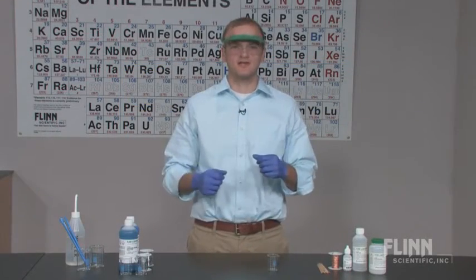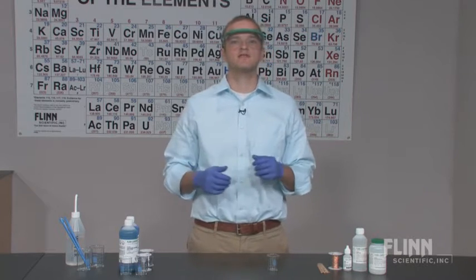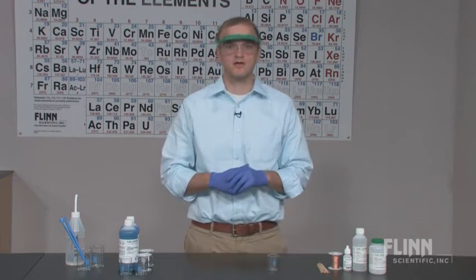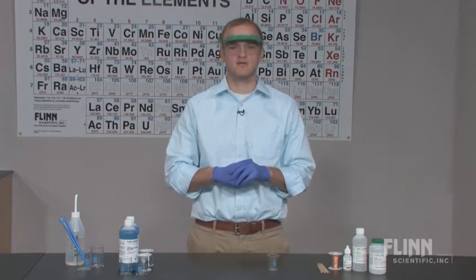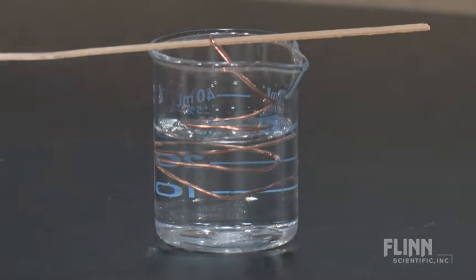It's stoichiometry in action. The mole ratios copper and silver nitrate laboratory kit from Flinn Scientific is a wonderful introduction to stoichiometry and redox chemistry. The reaction of aqueous silver nitrate with copper wire results in the visible growth of delicate silver crystals on the wire surface.